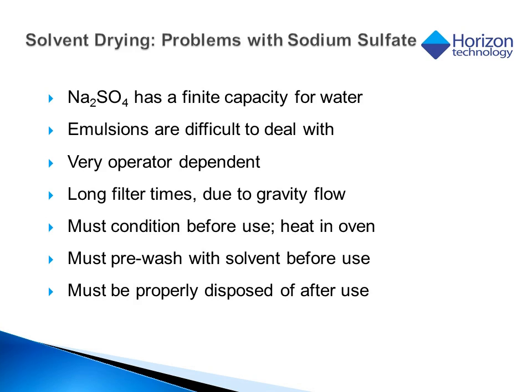Typically, long filter times are experienced due to gravity flow. You must condition the sodium sulfate before use, and it needs to be heated in the oven. And the sodium sulfate must be pre-washed with solvent before use. And after being used, it is considered a hazardous waste and must be properly disposed of.